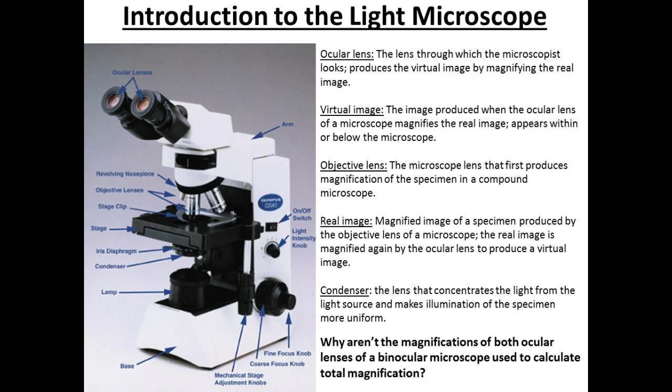You are going to have your own scope, so you can adjust these for the width of your eyes. If you're having trouble with that, I can help you by lining up the light with your pupils so that you can see just one round image. You should not see binocular like you do in cartoons. You want to get in the habit of doing that because you don't want to be squinting. I won't adjust your scope. I will look through or squint when I come over because I'm only looking for a second. You're going to be observing things much longer, doing drawings or taking pictures or whatever.